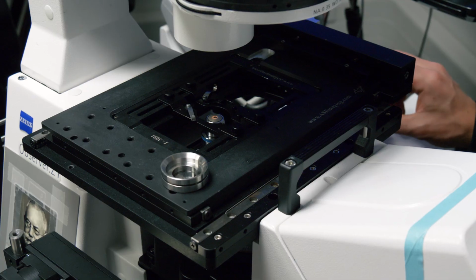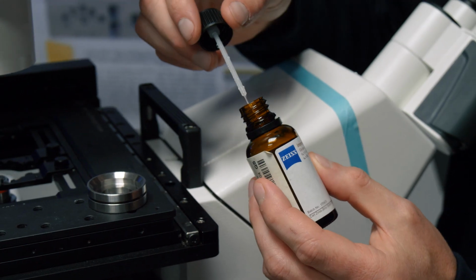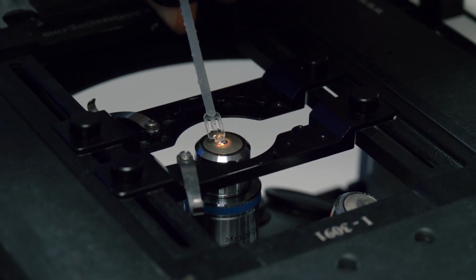Center the microscope stage using the joystick on the right side of the microscope. Before mounting your sample, if you will use the 40x or the 100x objective, you must place a drop of glycerine on the microscope objective. Use the tool attached to the bottle cap.